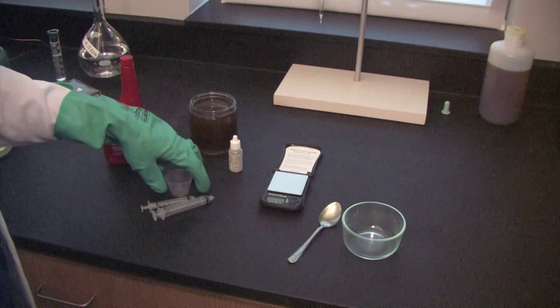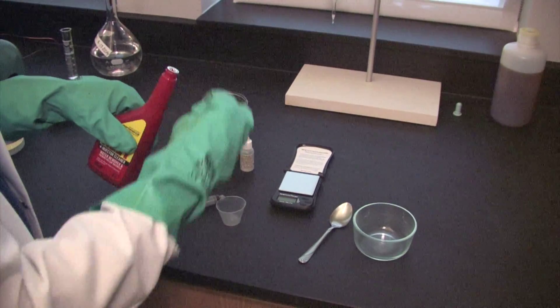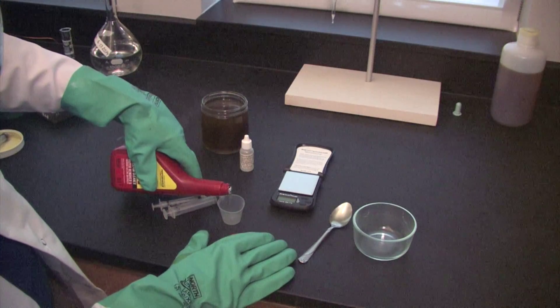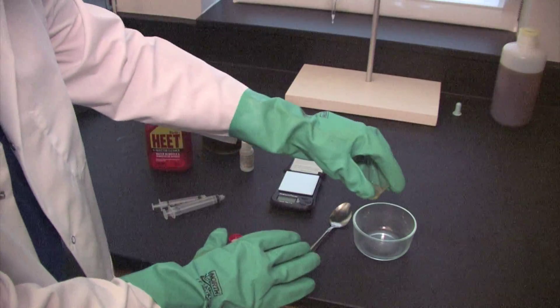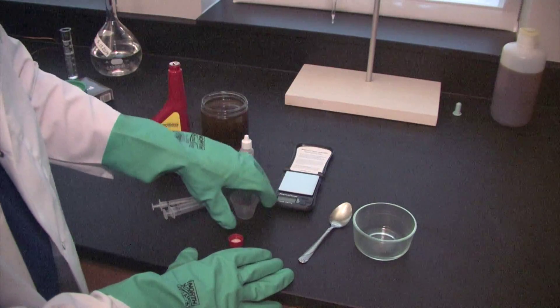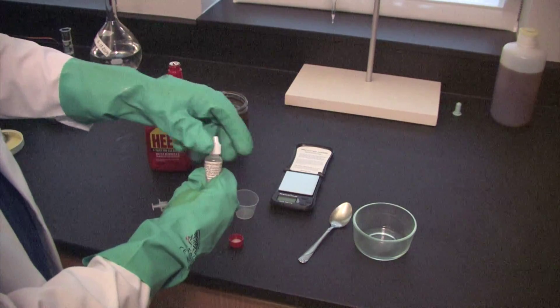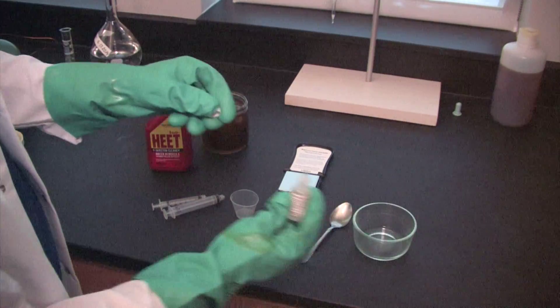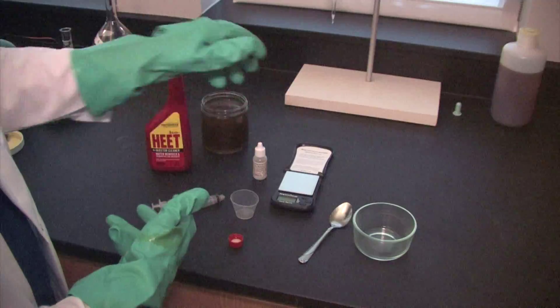When we start with the titration, we're first going to use our isopropanol. We're going to measure out about 10 milliliters using the medicine cup, pour that directly into our glass bowl, and then following that we're going to take some of our phenolphthalein indicator and put two drops into our bowl. Remember, that's going to create a color change that allows us to measure when the acidity has been neutralized.